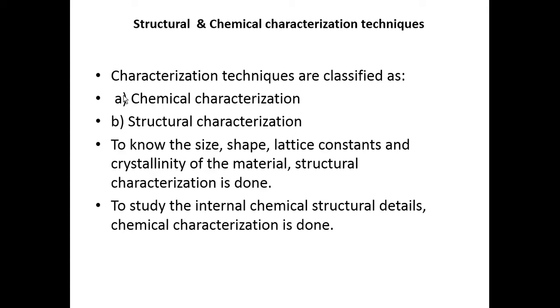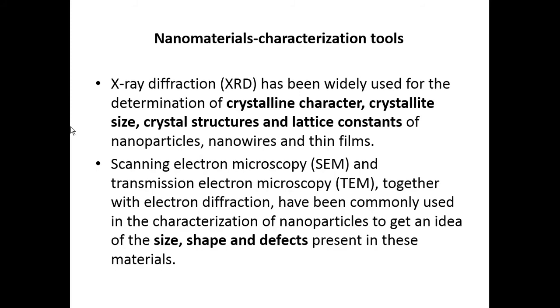To study the internal chemical structural details, chemical characterization is done. So this is the chemical and structural characterization usually done on nanostructures. So what are the nanomaterial characterization tools? We will discuss some of the characterization tools and develop them gradually one by one.